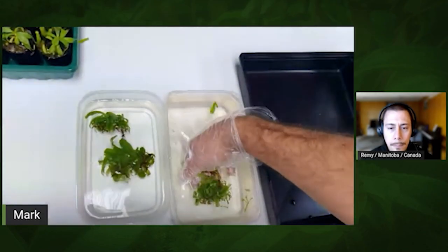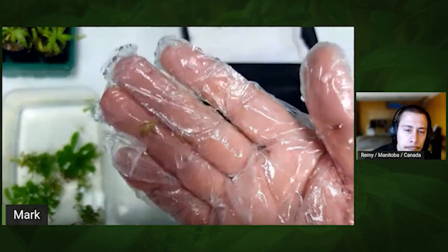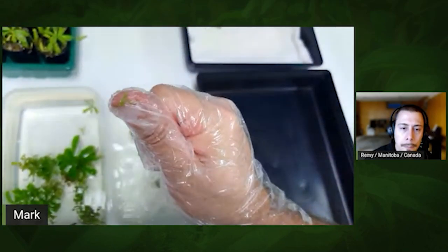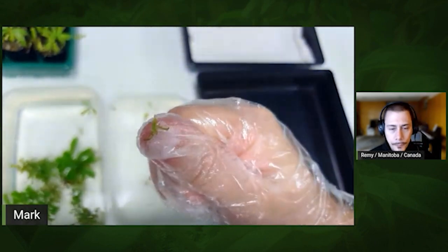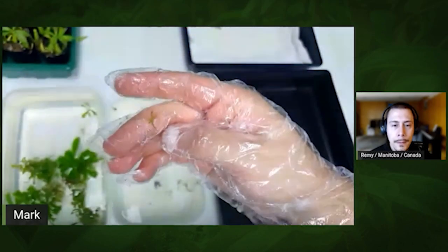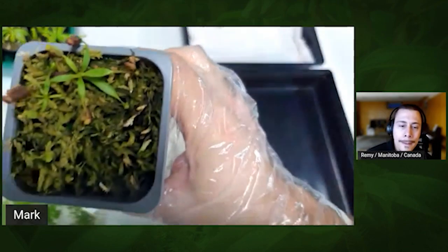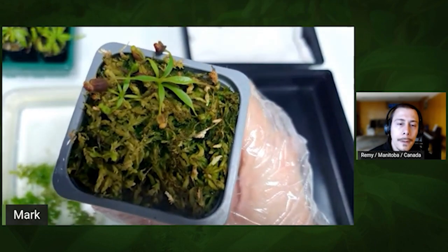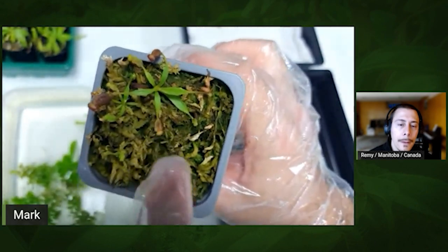I'll take them from the first container and transfer them to the cleaner water — two stages of cleaning, not just one. For example, this small piece here — when I was deflasking lowii a few months ago I got a similar piece and was almost going to throw it away. Instead I just put it in the media to see how it goes. To my surprise, let me show you how it looks now — you can see one, two, three plants. Those were super tiny pieces I was going to throw away and now they're almost established plants.